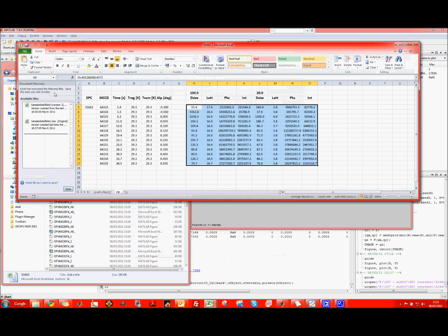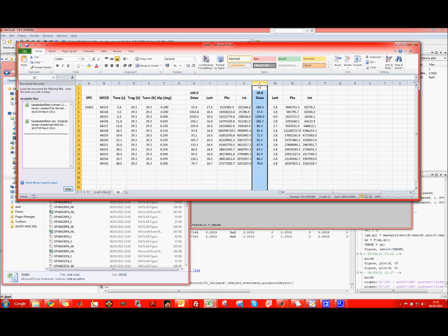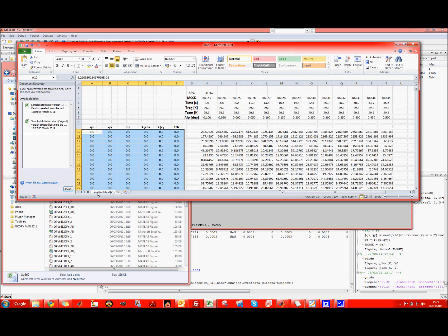We get again this file, but clearly in this case we don't have the paracrystalline correction, because to do that we need 3 peaks. So we've got the first one and the 0 to 0. Let's just step back. And line profiles. So every time you want to plot the line profiles, you need to use the Q-abs as a x-axis.